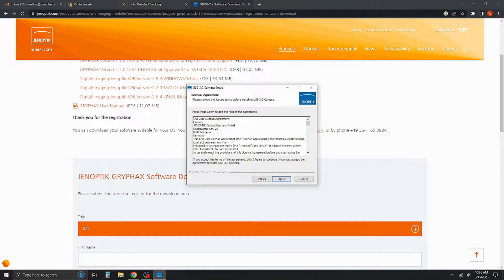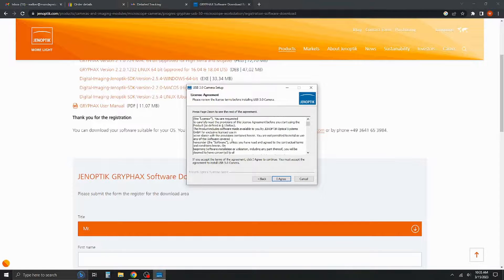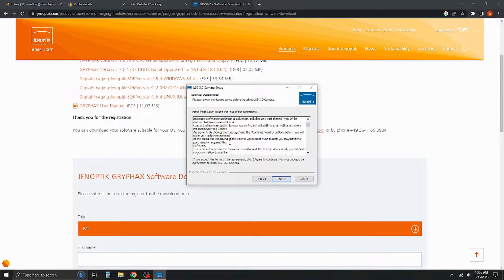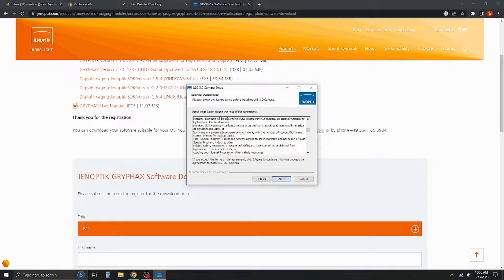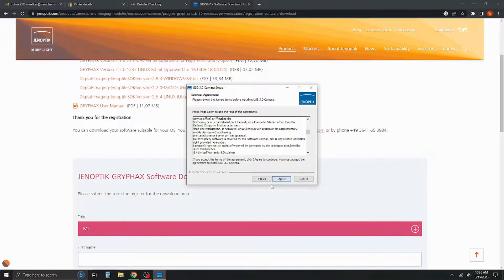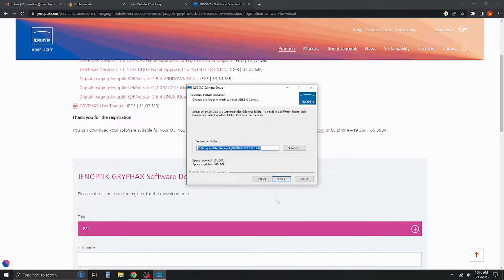This is their license agreement. You can scroll through that. Give it a read if you want to. We're going to go ahead and say I've already read all of this, and we're going to go ahead and hit agree.